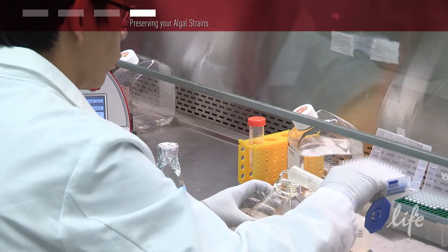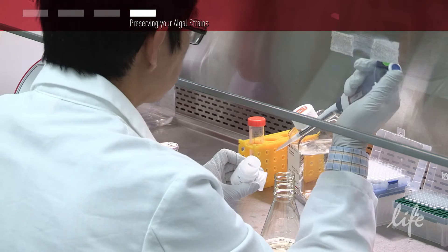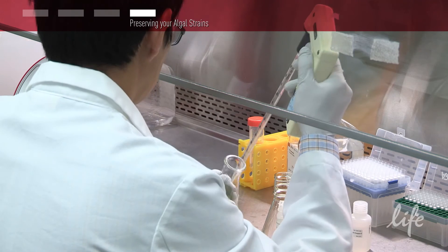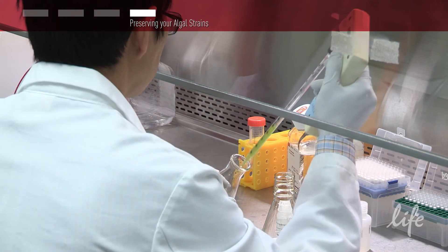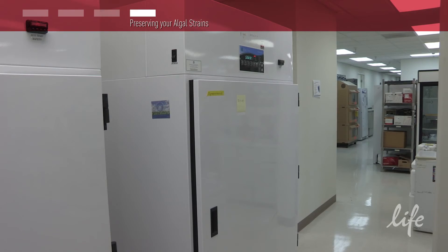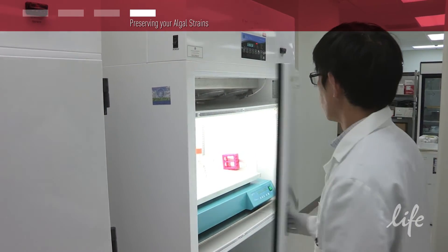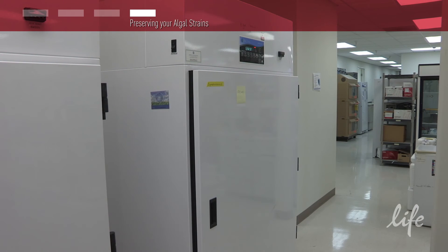To preserve your strain, start with 50 ml of sterile TAP media with 1 ml of Reagent A from the Geneart Cryopreservation Kit for algae. Now inoculate the media with 0.1 OD of Chlamydomonas cells, then add to the shaking incubator overnight at 50 microeinsteins, 25 to 28 degrees Celsius at 110 RPM for 72 hours to gain an OD of 0.9 to 1.2.